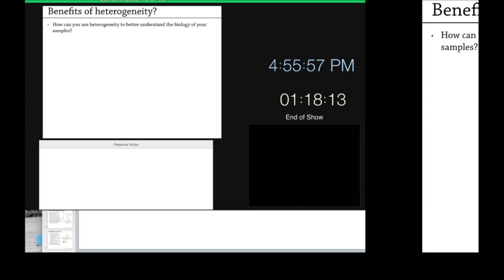So we're still early on trying to actually build models of this, but just looking at the raw data, we think that the heterogeneity exists because there are some of these weak dimerization interfaces elsewhere in the protein, and these rod-like things tend to flop around like this. And does that have correlations with biochemistry or genetics or any other information that you have previously about the system? That's our hypothesis. Once we get the model, we're able to tease out this heterogeneity a little bit more. We'll be able to test that.